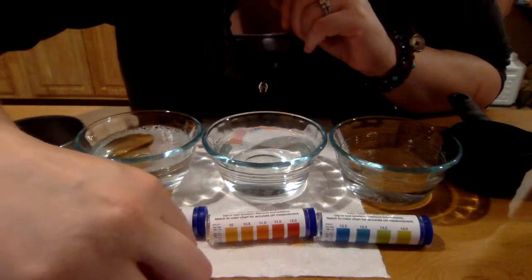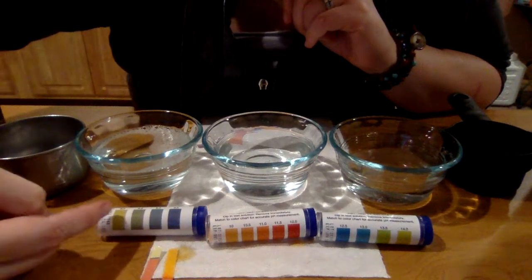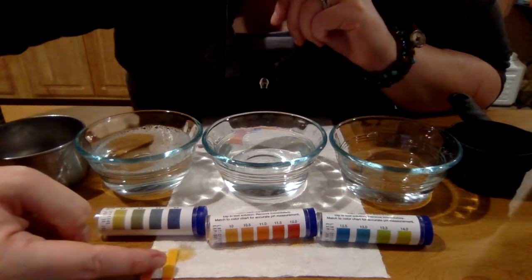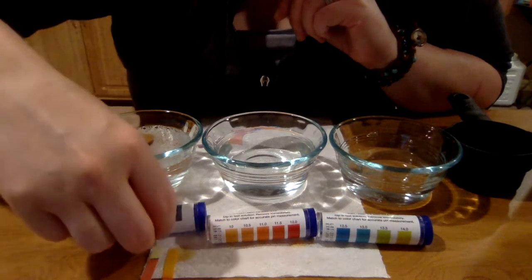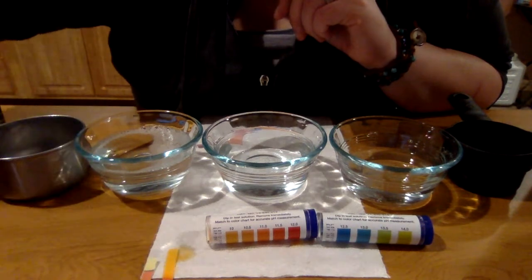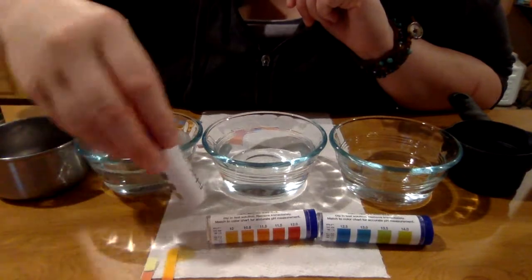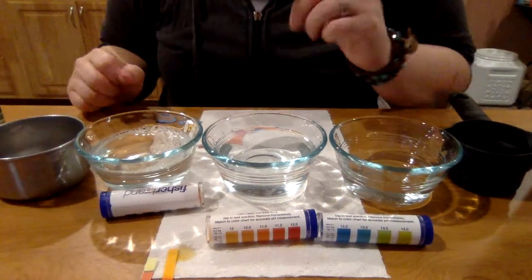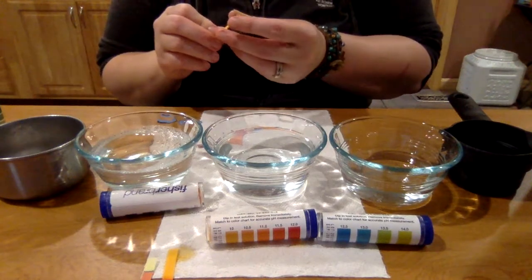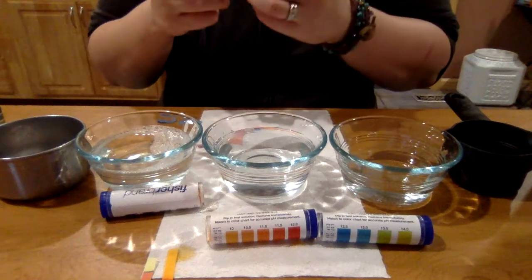This one doesn't really quite match those. Even though it's lighter, it doesn't even really match that. That's kind of a yellowish green. That's not yellowish green. So I'm going to say, okay, possibly 9.5 for bleach, but still too close to tell. So I'm going to roll it to the back. Not quite convinced yet that they fall within that range. So let's grab the next one, which is 10 to 12.